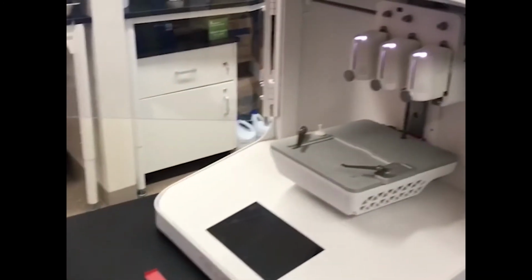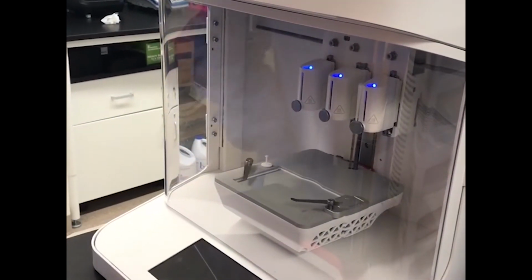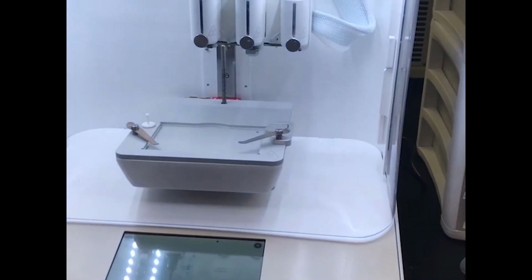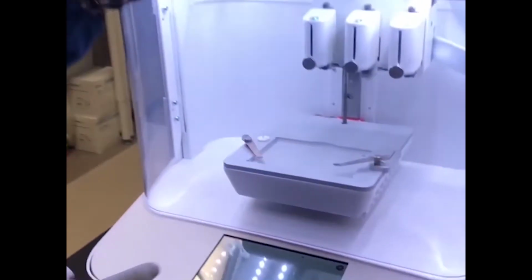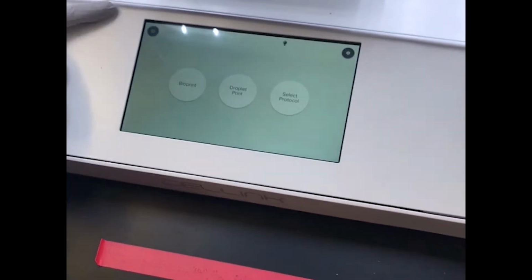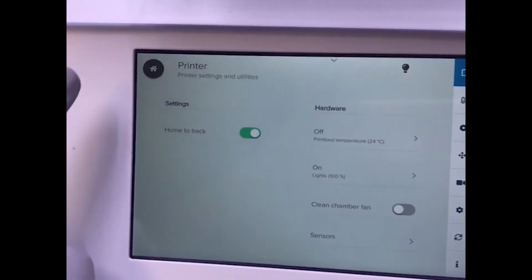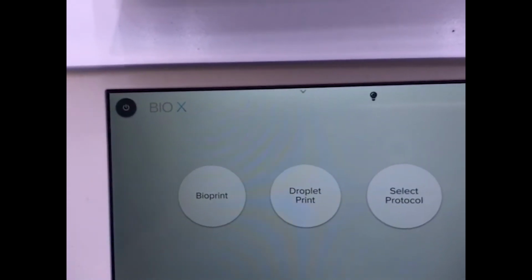So turning it on, we turn it on from here in the back, and that gives power to it. I'm just going to close this really quick. Alright, and as you can see, turning on, it has various lights on it. When it finishes printing, it turns green and it's really happy with itself. It's interesting. So here's the home screen. As you can see, you have a few options turning it on and off here at the top corner. Various setting options which are actually really useful for controlling the print heads and different things, especially when you're switching out the print heads.